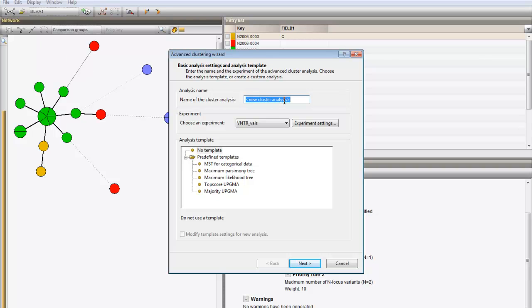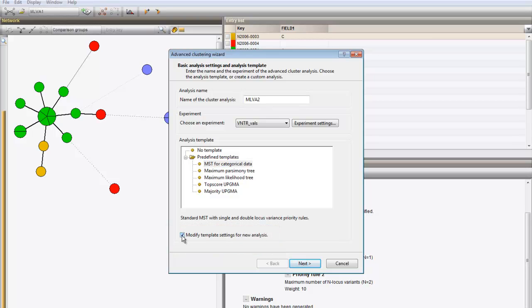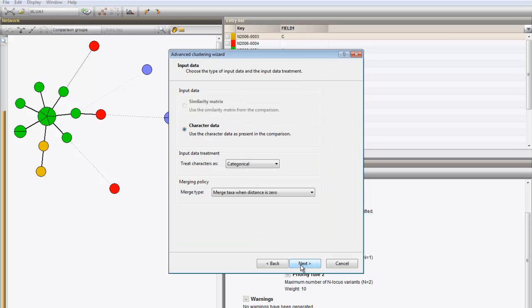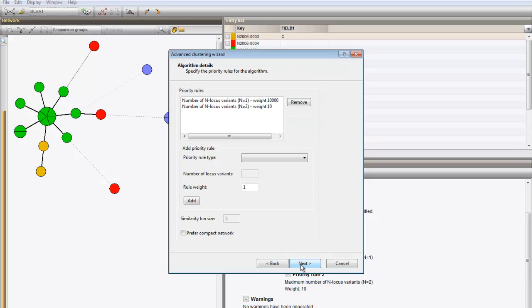I give it another name and I enable the option to modify the settings for the template. Press Next three times and this brings you to the part of the wizard where you can remove or add priority rules. I will add a third rule.